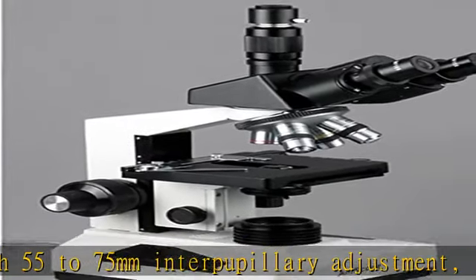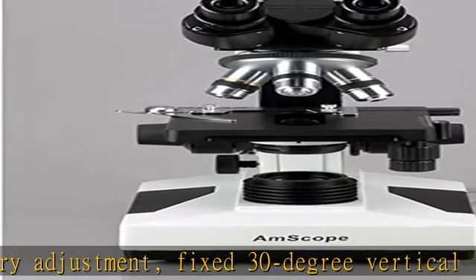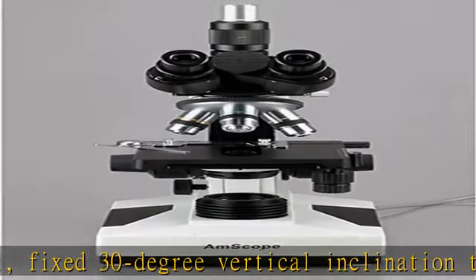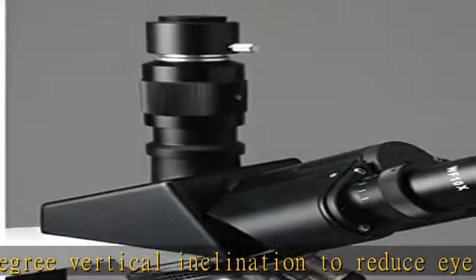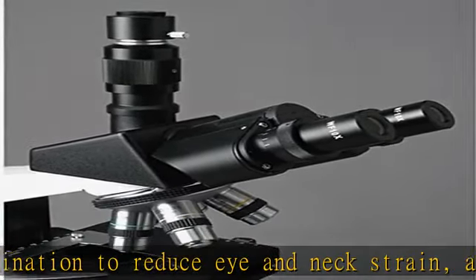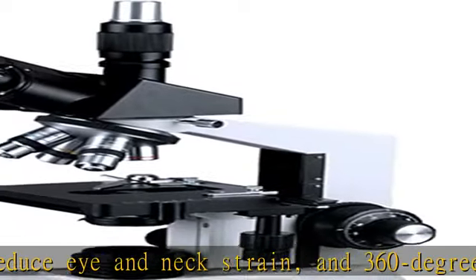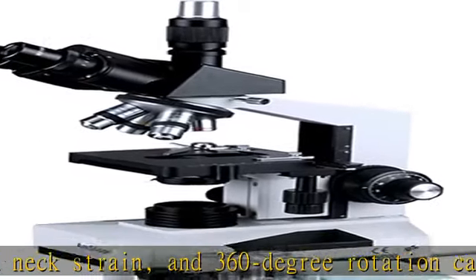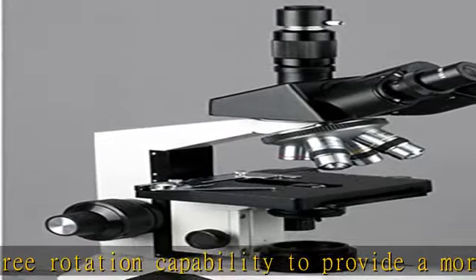Halogen illumination with rheostat to control light intensity, and 1.25 NA Abbe condenser with iris diaphragm and rack and pinion focus control for precise focus and clear examination. Double layer mechanical stage with 1mm stage divisions and stage stop, graduated coarse and fine focus with tension control to prevent stage drift.